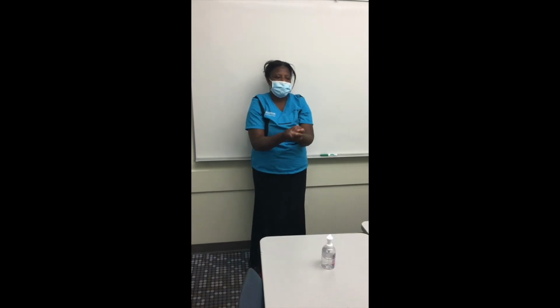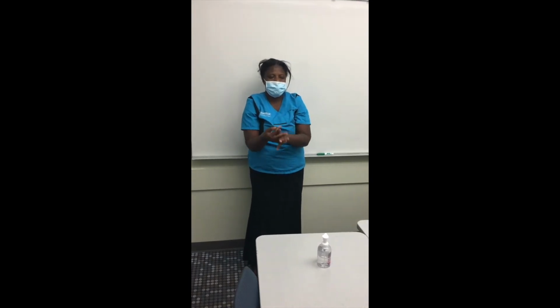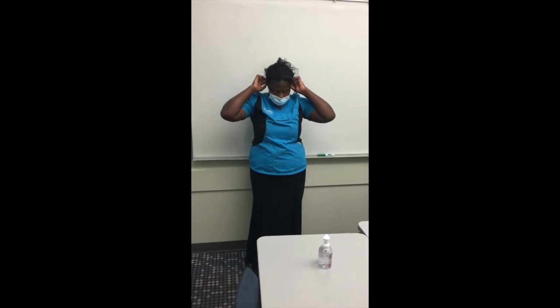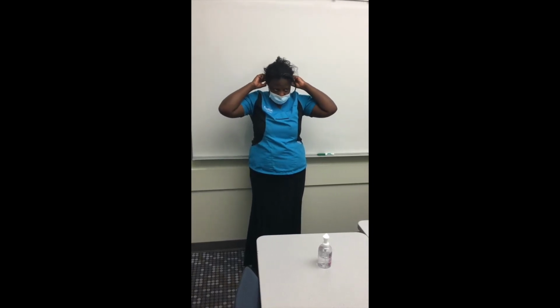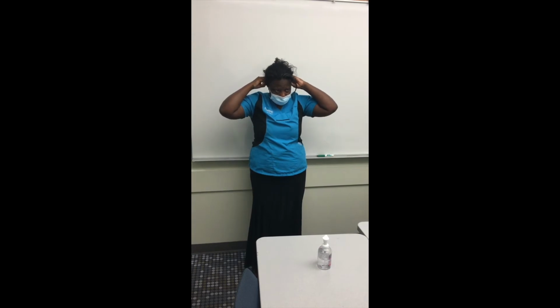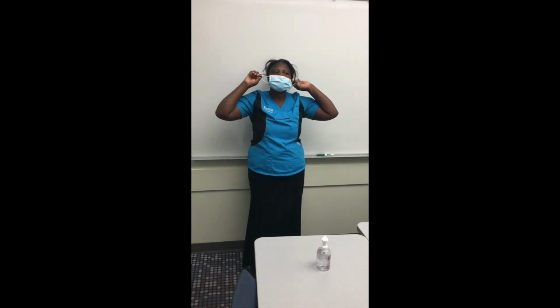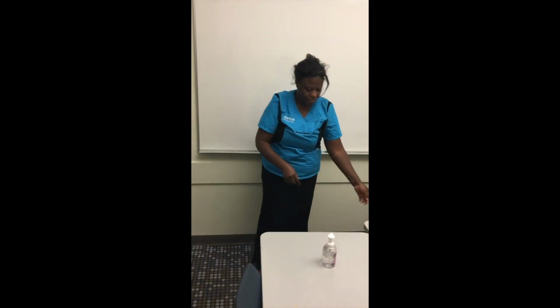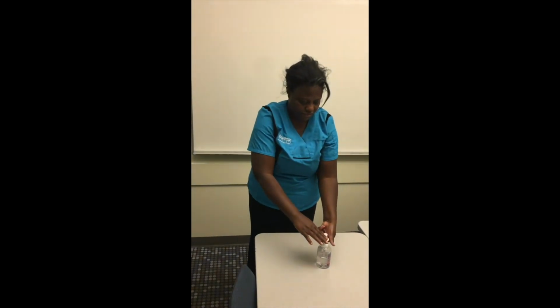The last thing to remove is the mask. Remove the mask by holding the ear loops. Do not touch the outside contaminated part of the mask. Remove it away from you, throw it into the appropriate receptacle, and perform hand hygiene.